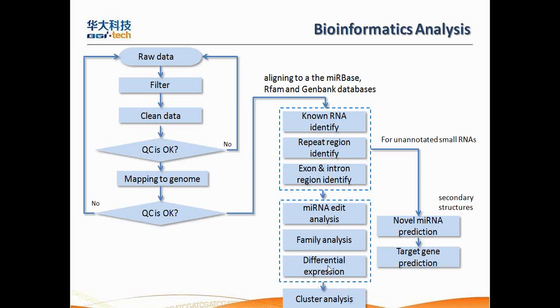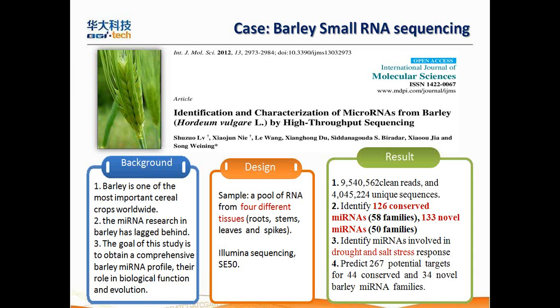After we get the differentially expressed genes, we can cluster those with similar expression change, and microRNAs with similar expression change patterns are probably related to similar functions, or maybe involved in the same biological process. That's what we do in the bioinformatics analysis of small RNA sequencing.